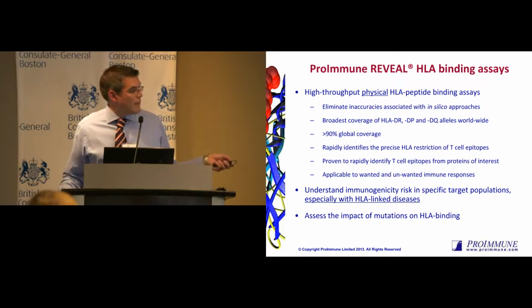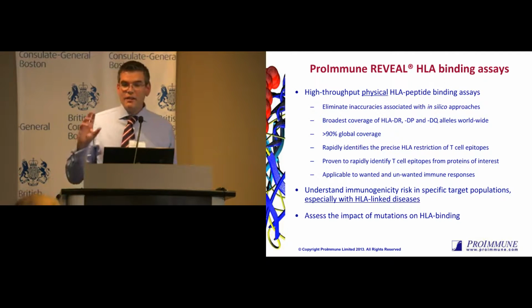So this allows us to rapidly identify the specific HLA restriction of individual peptides, and of course you can then use that even at the design stage where you're introducing point mutations to see whether that's going to enhance or reduce binding to a specific HLA allele.